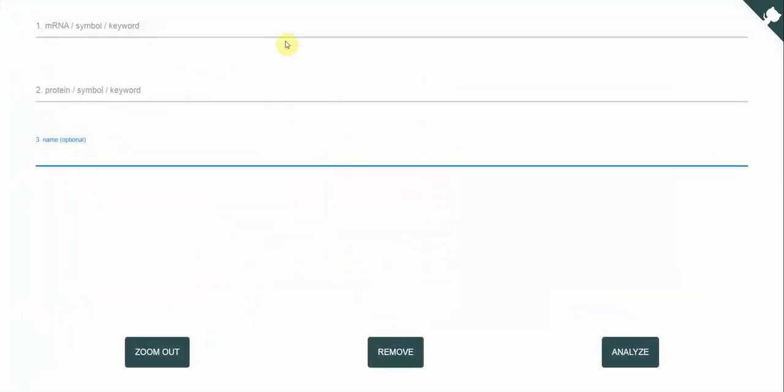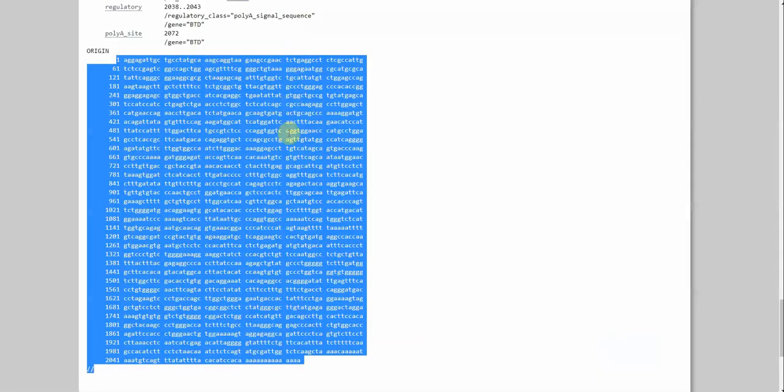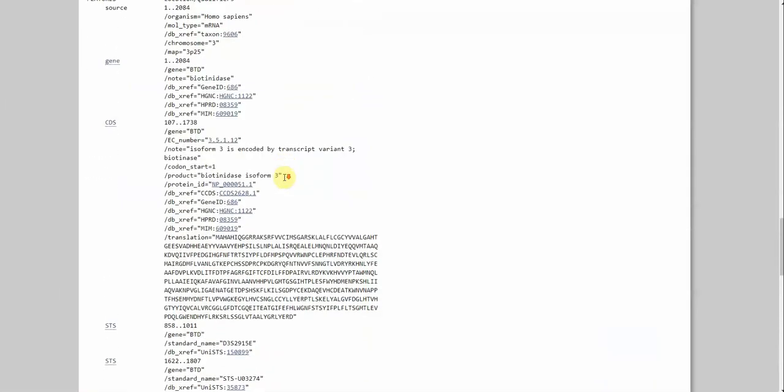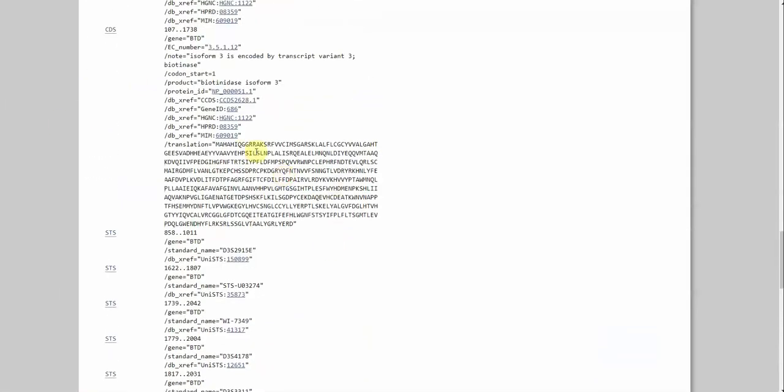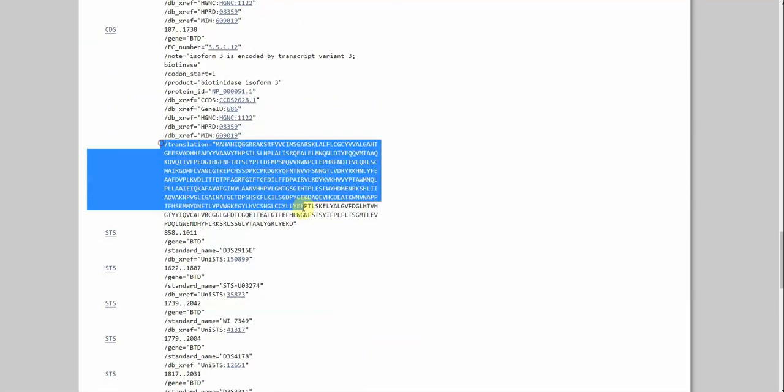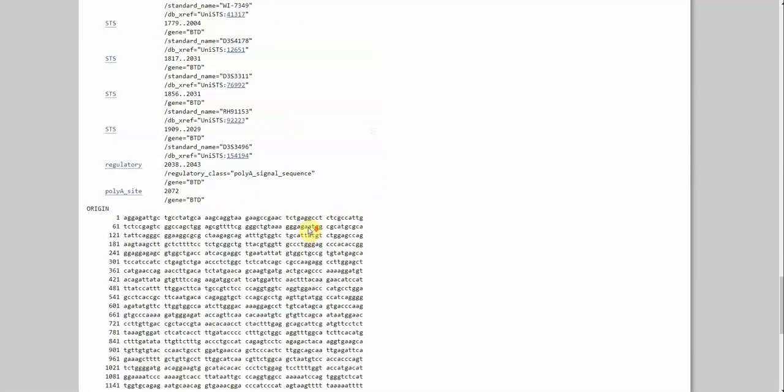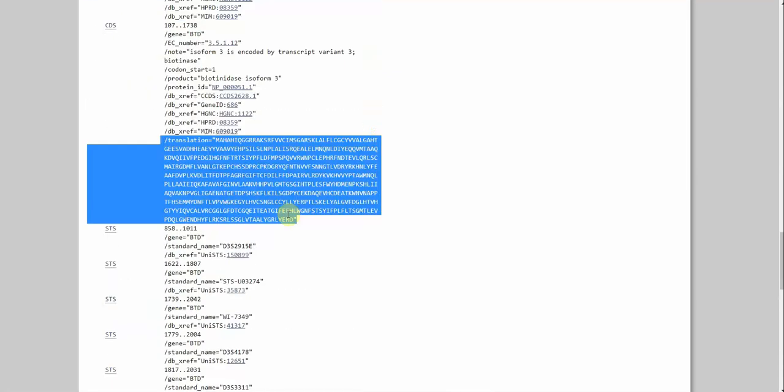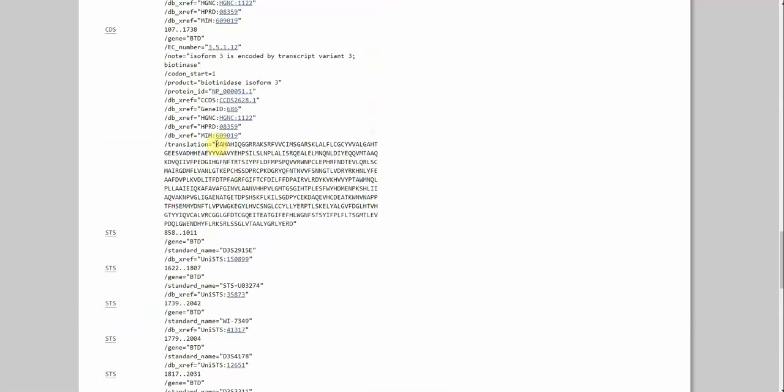So what I will do is you can use UCSC table browser, Ensemble or anything that fits your agenda. What I will do is I went to NCBI and here we have an example gene. Two fields that are important for you is the translation field and the mRNA field.